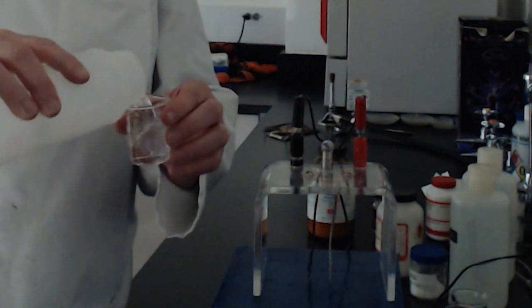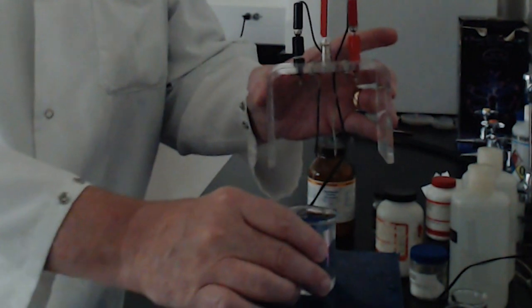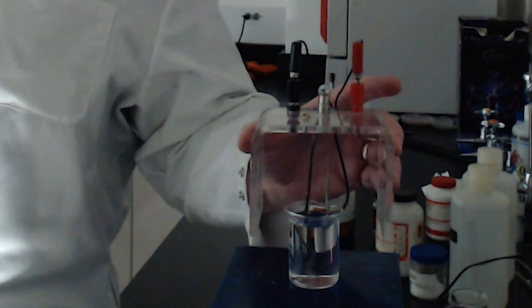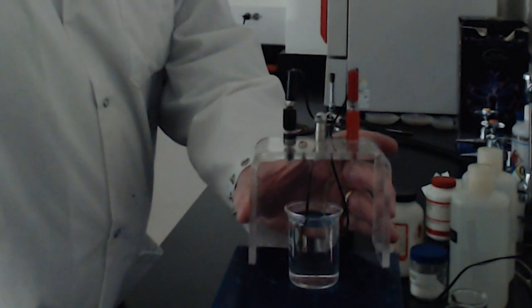So the first myth we always have to remove is, does water conduct electricity? We have here some ultra pure water. When my kids were watching the Pokemon show, whenever Pikachu was in trouble, they just doused Onix in water and it'd be electrocuted. Now I just put my electrodes into the water, and can you see the light bulb turning on? And the answer is no, this one is a non-electrolyte. So if water ever shows up on your quiz, please put non-electrolyte.